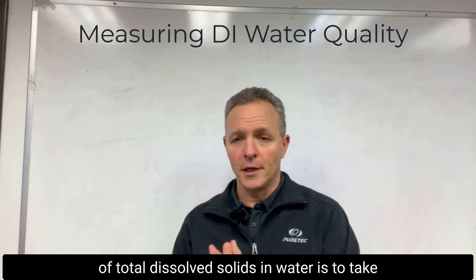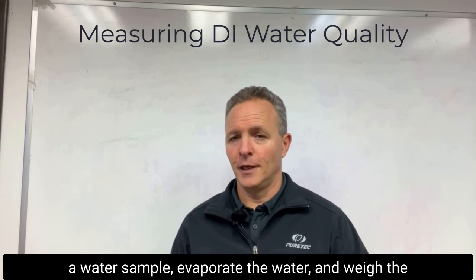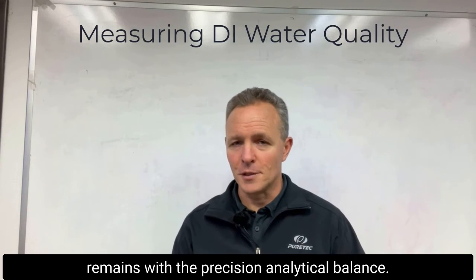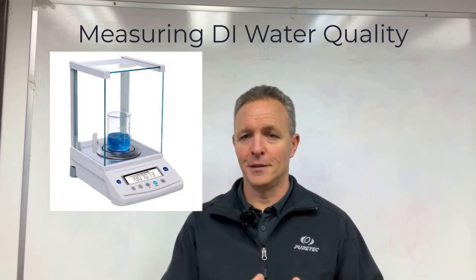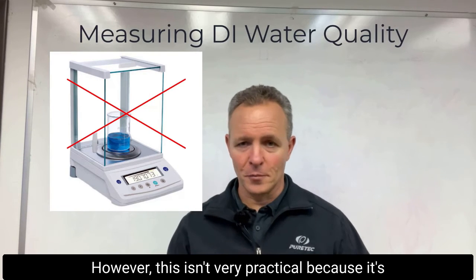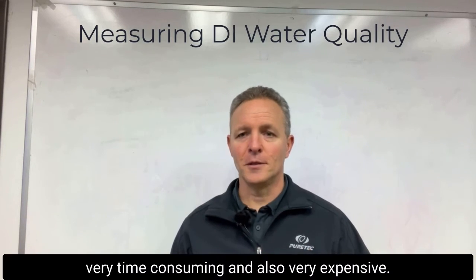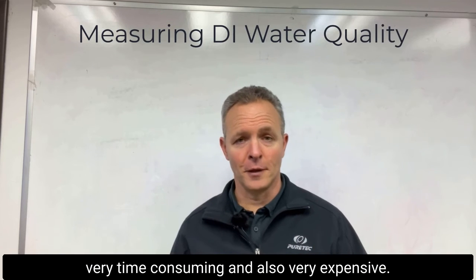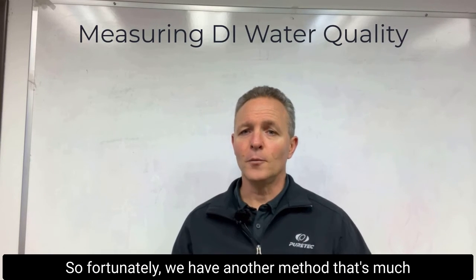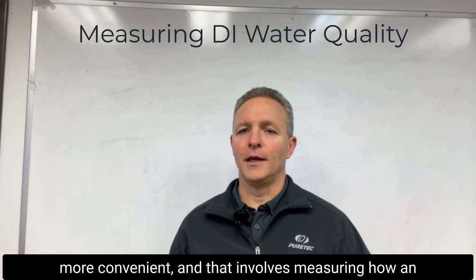The most accurate method for measuring the total dissolved solids in water is to take a water sample, evaporate the water, and weigh the remains with a precision analytical balance. However, this isn't very practical because it's very time-consuming and expensive, so fortunately we have another method that's much more convenient.